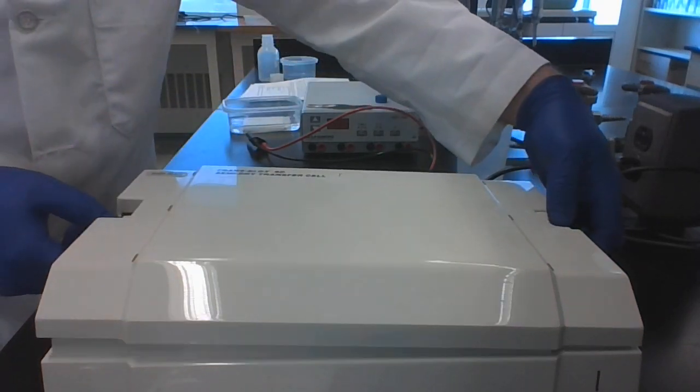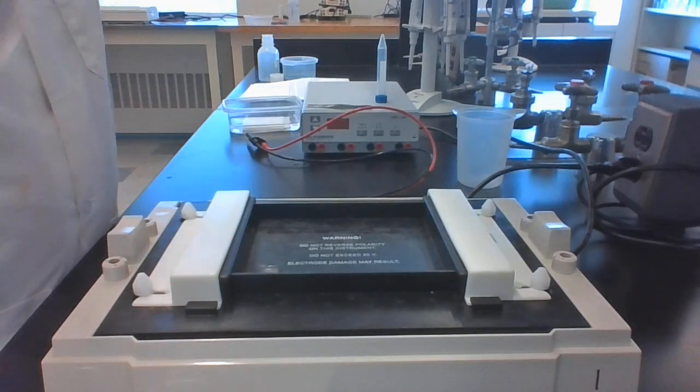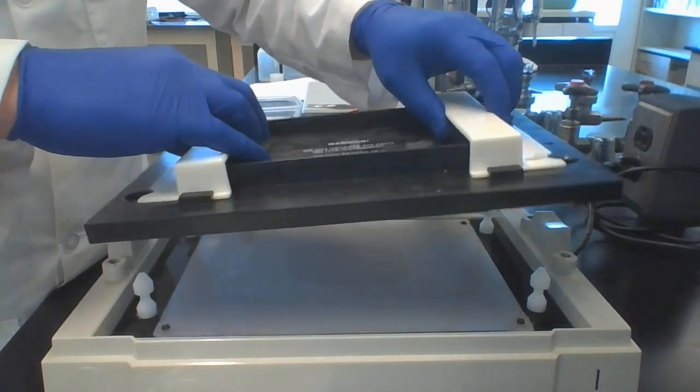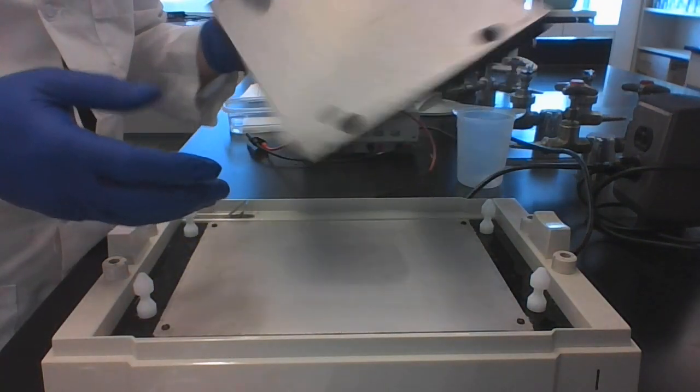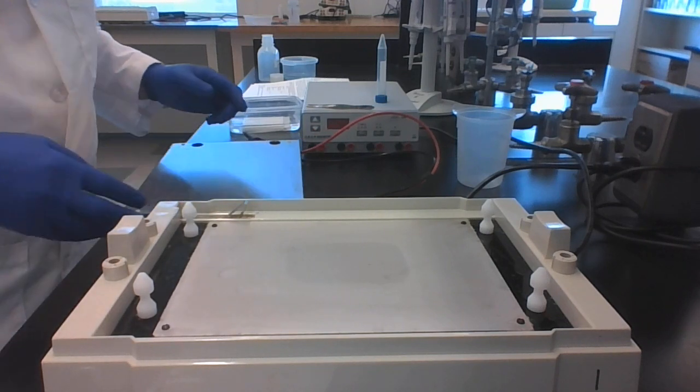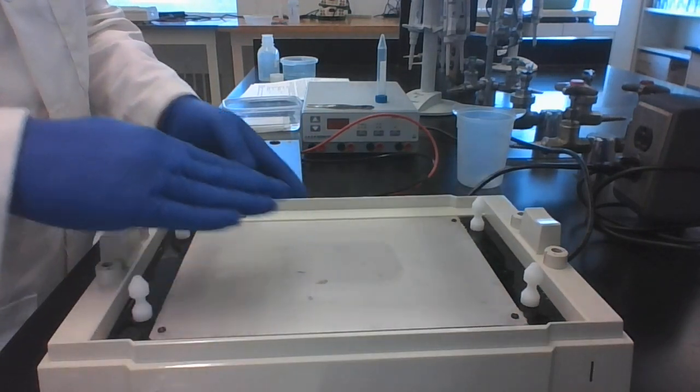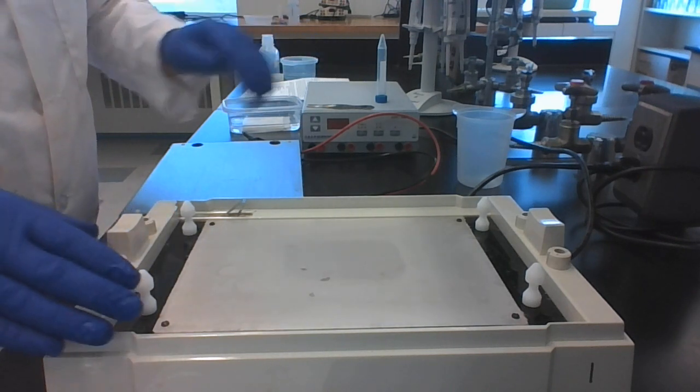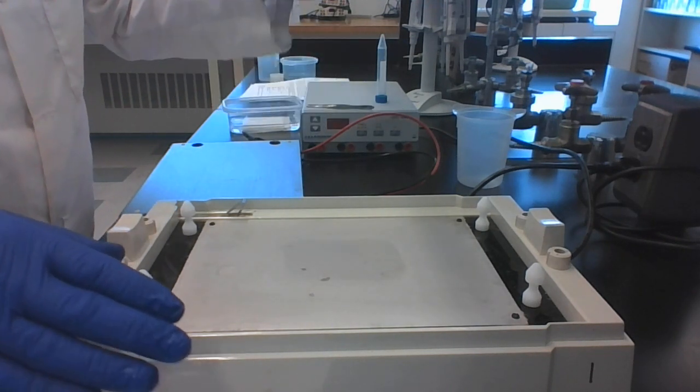So we have one lid we take off, we just set it in a nice safe place. Then we have our negative electrode, which we take off, and we have our positive electrode. So the proteins are going to move from the top down through the gel and onto the membrane.